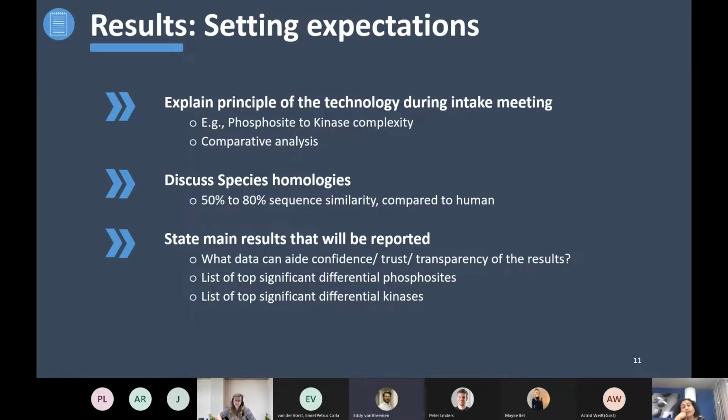So I think we could develop a mouse or other species. Mouse would be the first one. Just to add on here, the databases that we use for the upstream kinase analysis are also for humans. So unless we have mouse equivalent databases, that might take a little bit more time. Okay. Right. So that is fixed databases that we have.